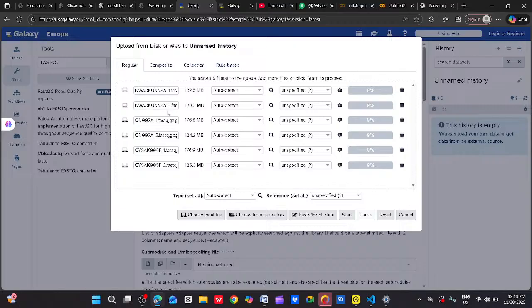I have two isolates that are still left somewhere, which we do not have because they did not pass the quality control level, and that's why that one has to be discarded. I will look for another very clean isolate that we are going to be able to sequence.